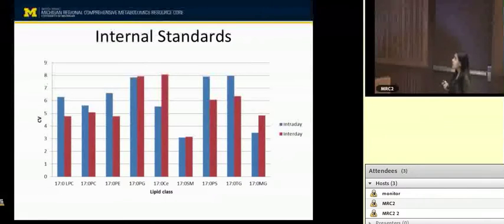If you don't have a specific standard for a specific class, you can use it based on the retention time, or you can use it based on the medians of all the internal standards, or you can also use it based on variance minimizing, like which one is minimizing the variance most. When we run a large number of samples, we do see batch effects. So for this, the smoothing technique, Lowess, works pretty well with our data sets. And other than that, you can fit a regression model to adjust for batch effects. Though a little bit of caution here, we use our QC samples to train our span parameters so that we don't overfit our data.